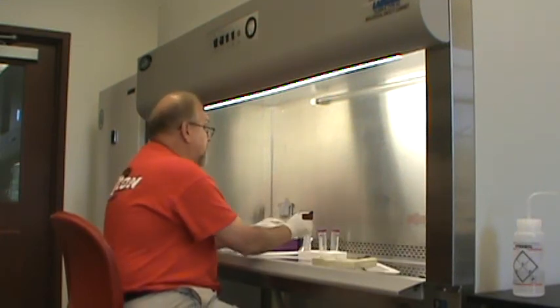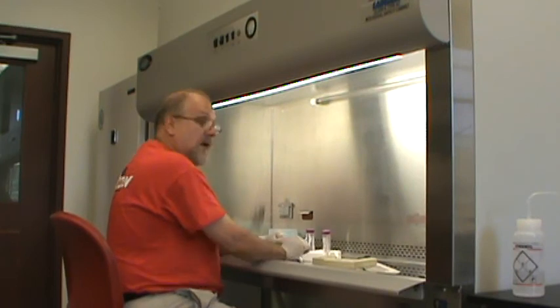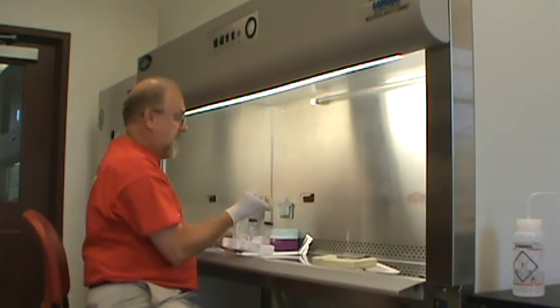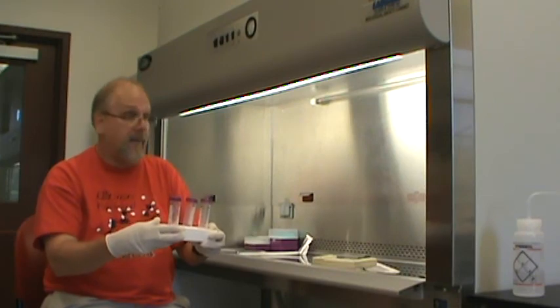These pipettes are disposable. When you are done, you can put the lid on. Once you have the lid on, you can take your sample out of the hood and do what you need to do with it — centrifuge it, chill it, put it in the incubator.